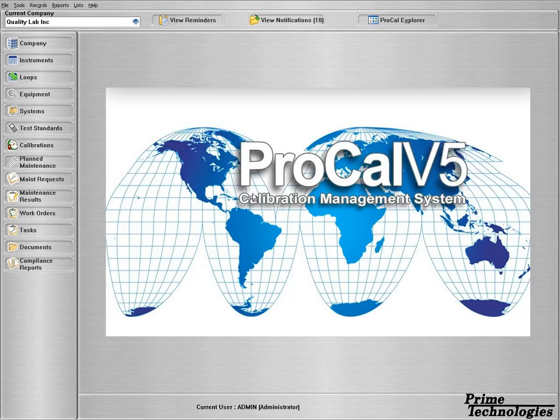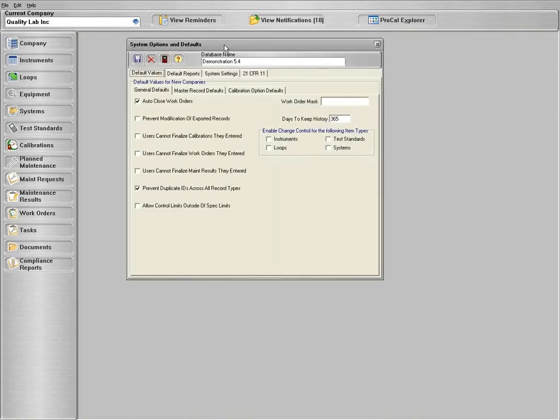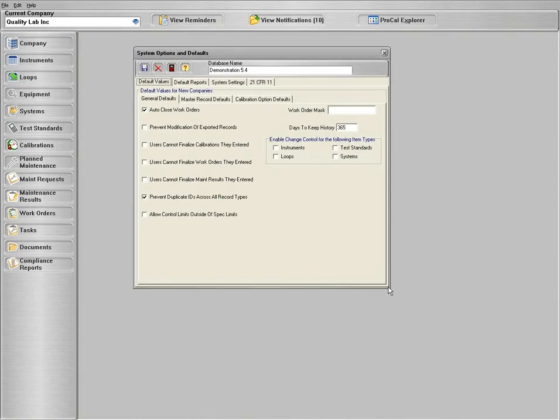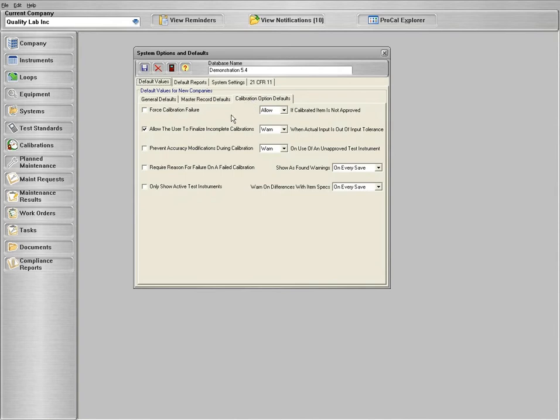Okay, in this training video for ProCalV5 we are going to cover the administration aspect of the application. The first thing an administrator would want to set up in their ProCal software is on the System Options tab, System Options and Defaults. You can set up general information, master record defaults, as well as calibration option defaults based off your company workflows and practices.